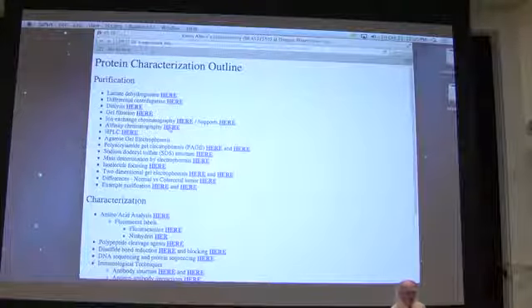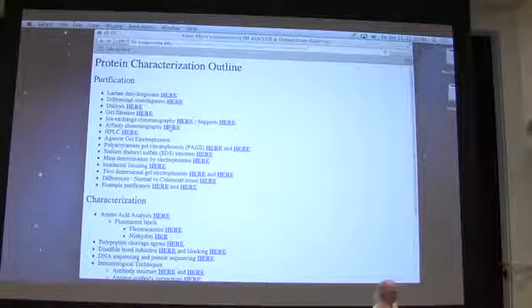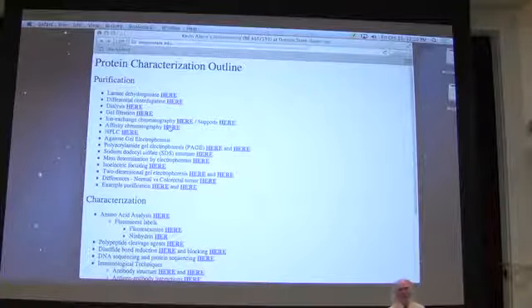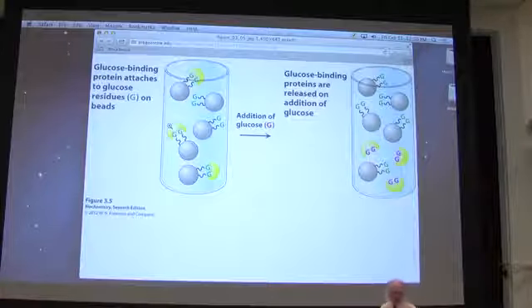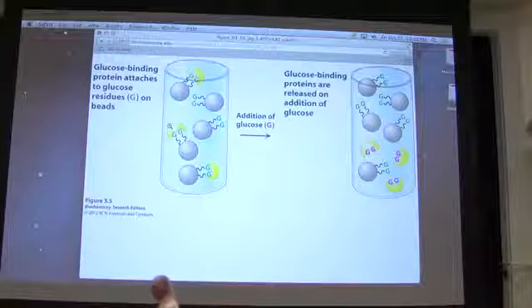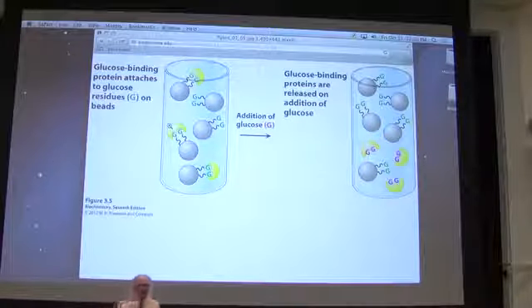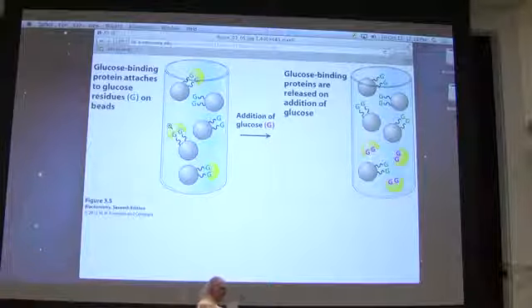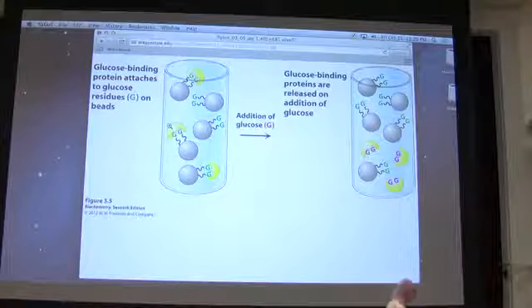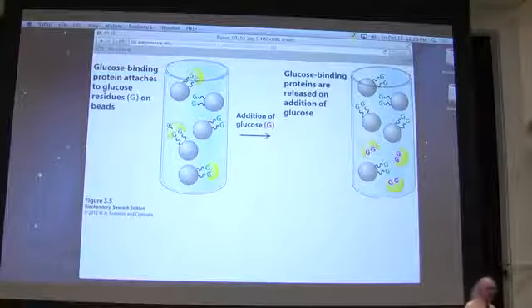Okay. Now, I'll tell you about a technique, another type of chromatography that is very powerful, and it's also very easy to understand. And whenever you can do this type of chromatography, you can usually reduce the number of steps in your purification process by a long ways. It's called affinity chromatography. Okay? Now, this technique also uses beads. But instead of having charges as the basis or having size as the basis, these guys rely on the fact that many proteins bind to other molecules.